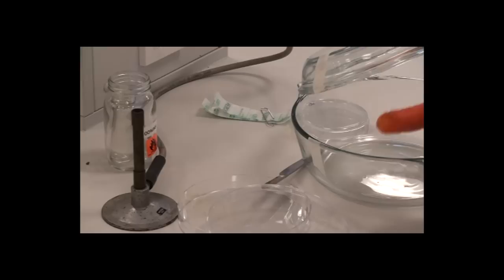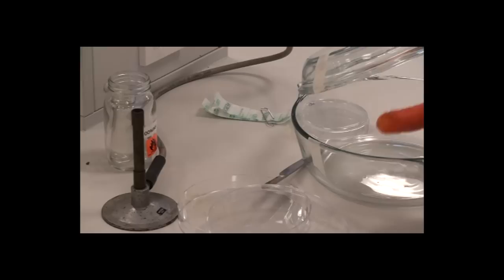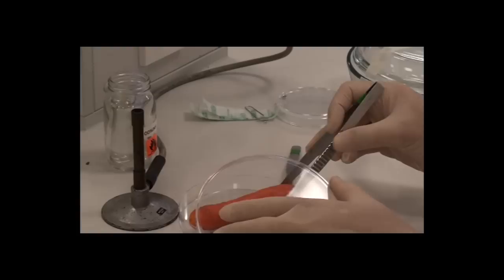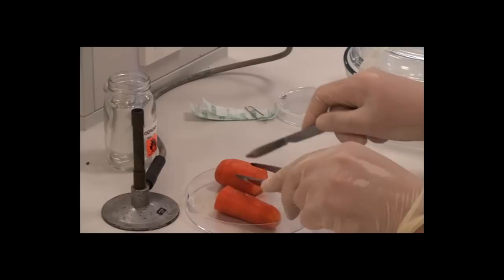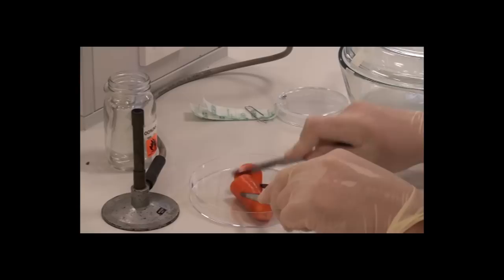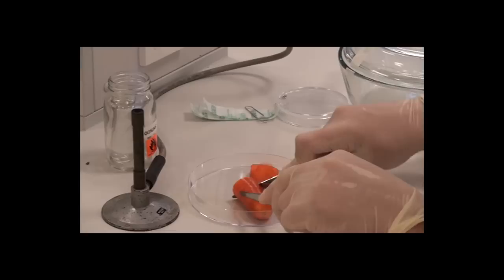I'm getting the carrot out of the jar, where it's been sterilized and washed, sterilized in bleach and washed, and now I'm putting it into the sterile petri dish here, and we'll then slice it into discs. Put that piece aside, and cut the discs, about five millimeters thick.